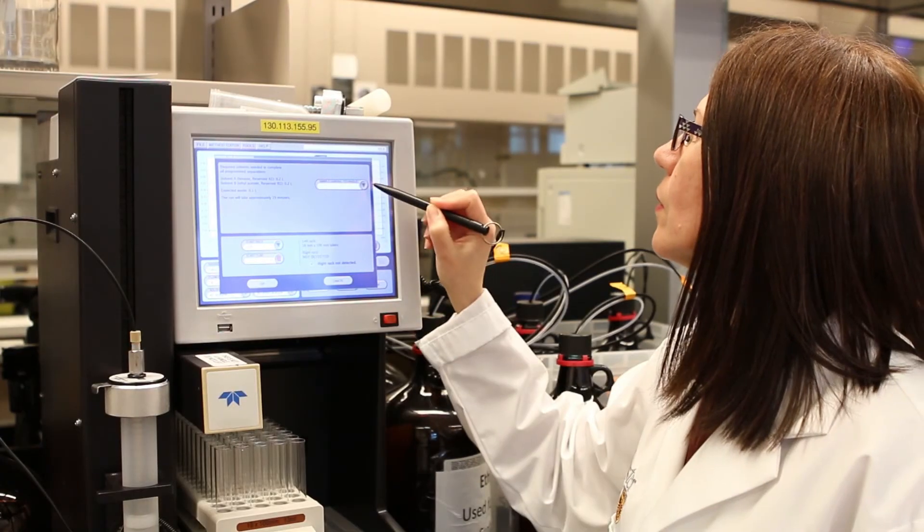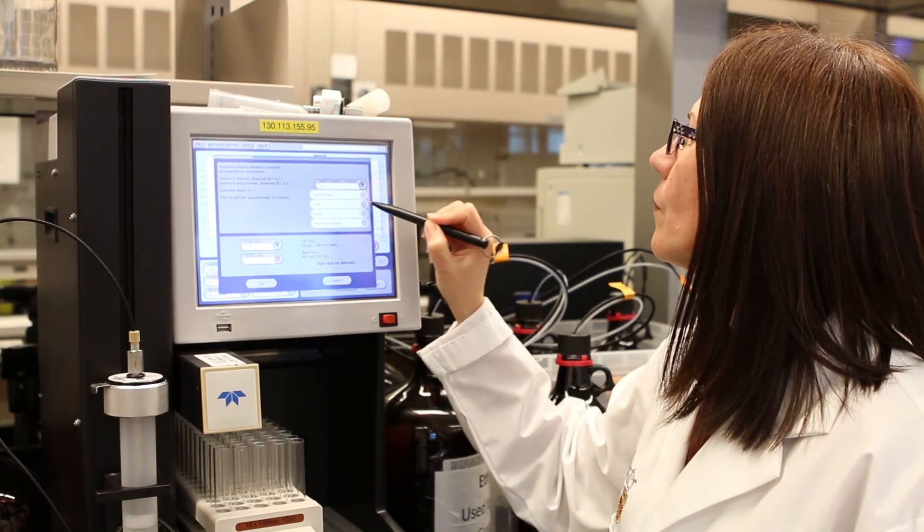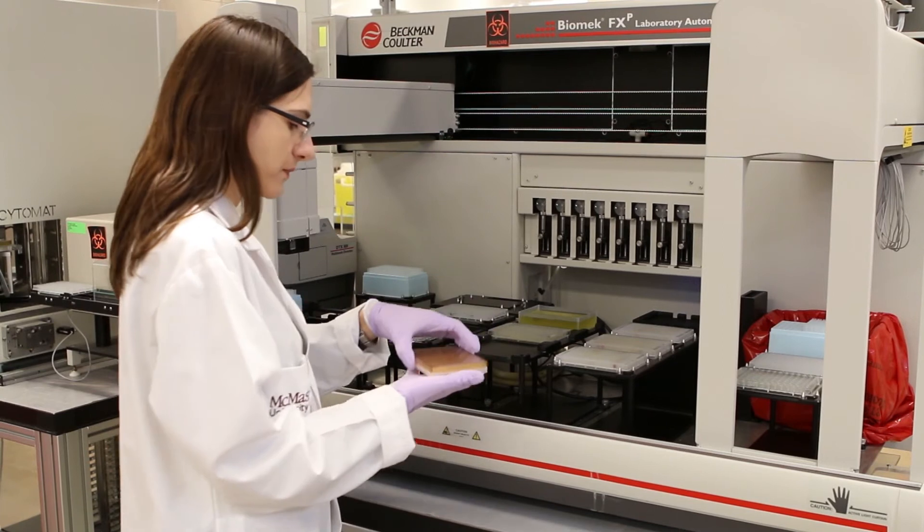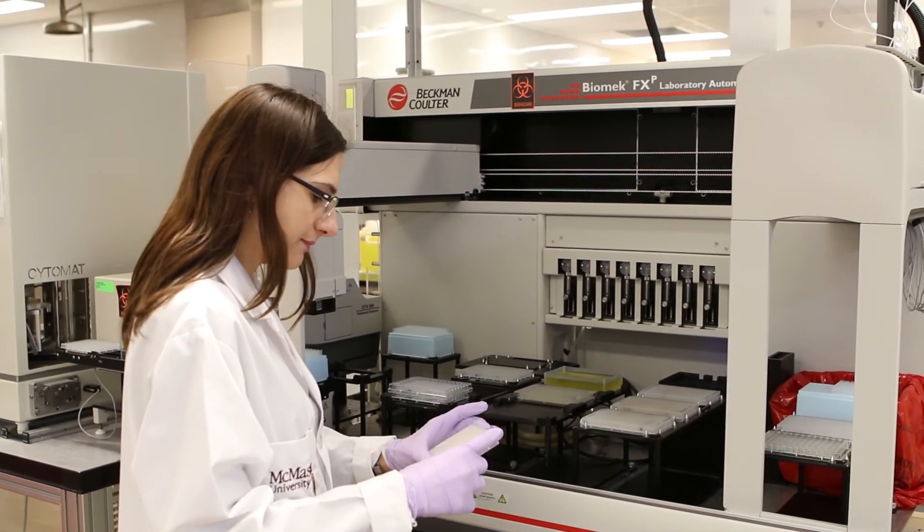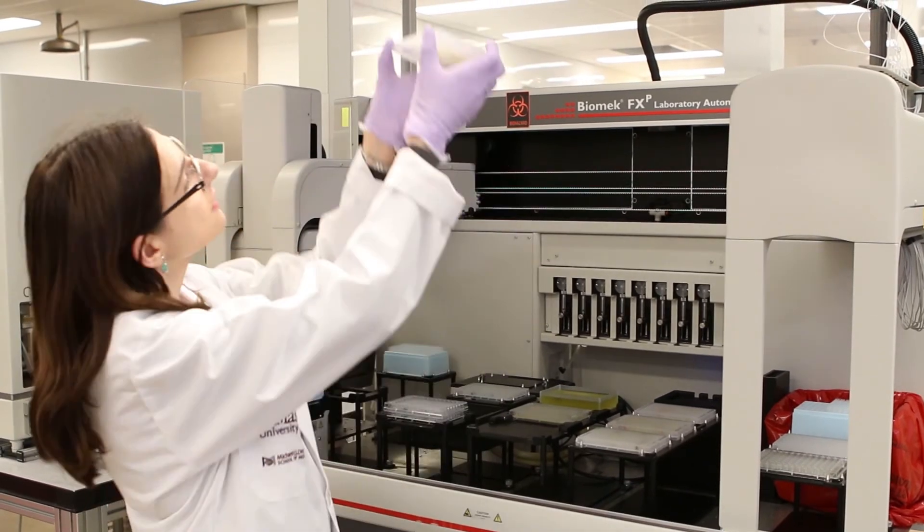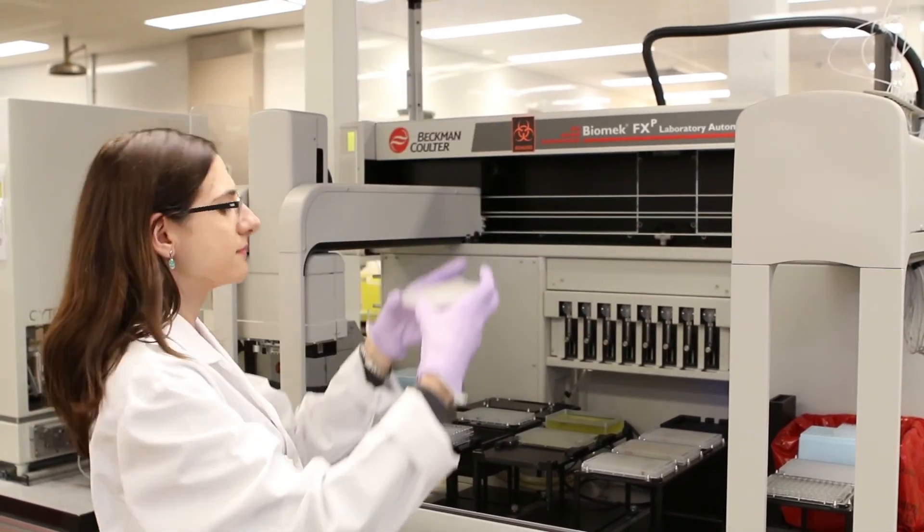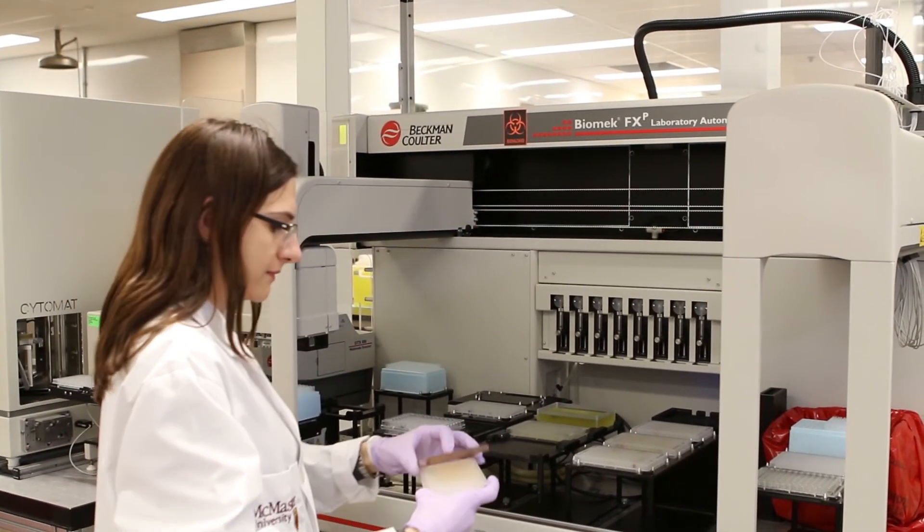The CMCB staff are integral to the success of the lab. They are highly trained experts in their fields who are there to make sure that, first of all, the equipment is well run, that the equipment is well maintained, but also to help you design experiments.